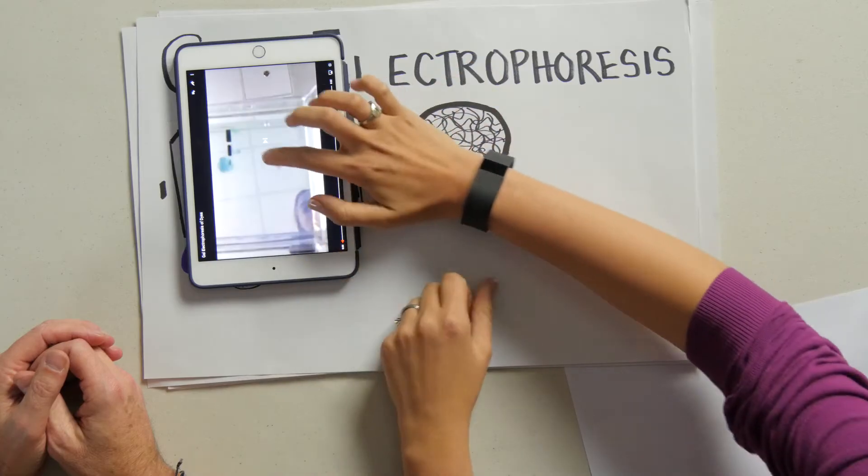Now Mary, you have a really ingenious way that you captured what happens in this process by putting a cell phone underneath a gel electrophoresis unit. Let's take a look in real life at our gel.